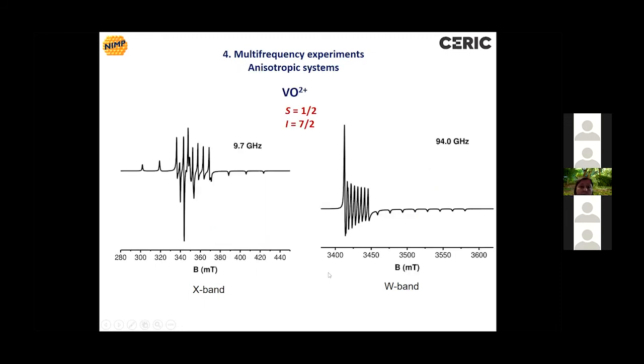The second reason: here there is a simulation of the spectrum of a vanadyl ion in lead zirconate titanate, in the X band.